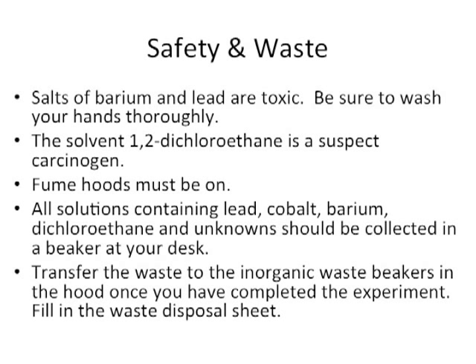Salts of barium and lead are toxic. Be sure to wash your hands thoroughly. The solvent 1,2-dichloroethane is a suspect carcinogen, and the fume hoods must be on.